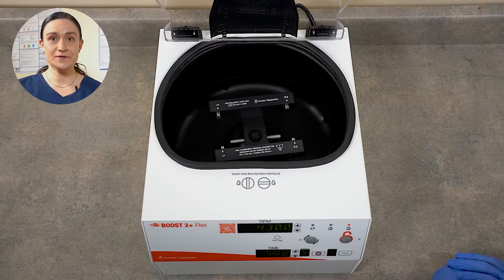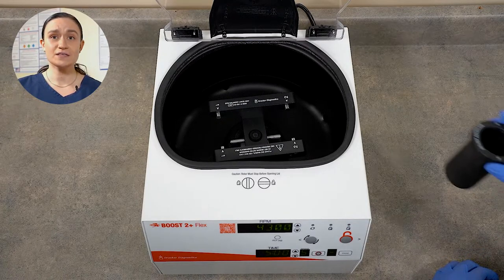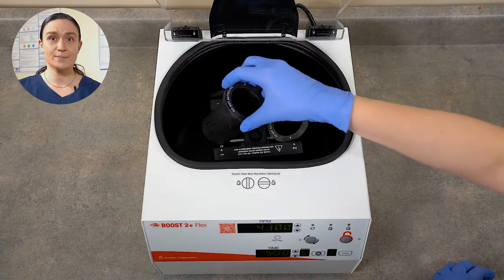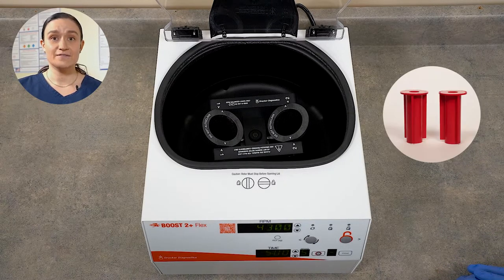Now we can see our rotor inside. Your Boost 2 Plus Flex arrives with the rotor installed and ready to run. All you will need to do is place those two black buckets onto the pins you can see here in the rotor. They do not click or snap into place — they simply rest gently on those pins. If you have any inserts for the tubes you intend to spin, you can seat them inside those buckets now. Your Boost 2 Plus Flex has only authentic Drucker parts, including the rotor and tube holders. You should only use authentic Drucker parts in your centrifuge, as anything else may damage it or even be dangerous.